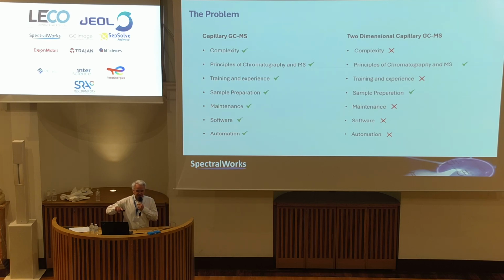And you've got statistics underlying all of this. We're doing peak detection. We're doing ion statistics even when it just hits the detector in the mass spec. They're doing centroiding. All of this is being accepted as something that happens every day. We're happy to have it.